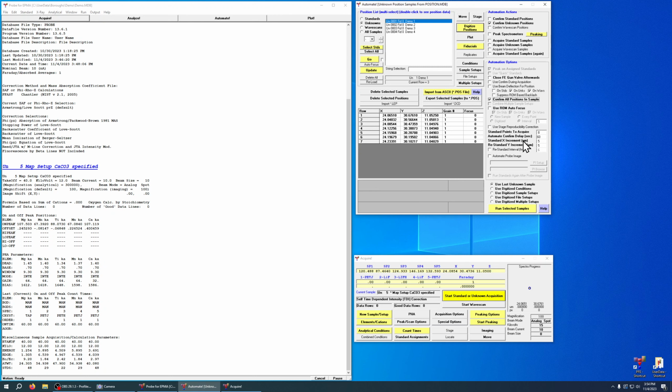And then the last thing to consider here is how long do you want it to delay between each confirm motion before it automatically moves on to the next one. I usually just set this for something much longer than it needs to be, so in this case 60 seconds will be plenty, and then it'll be counting down and I'll have to manually tell it to go on.